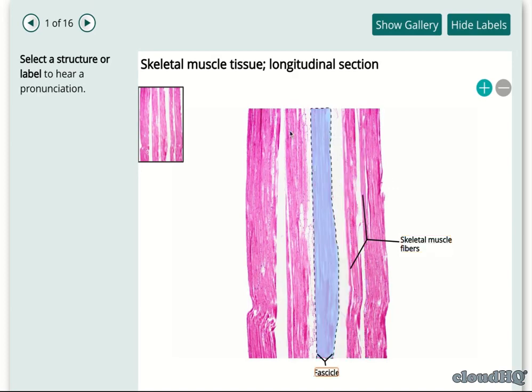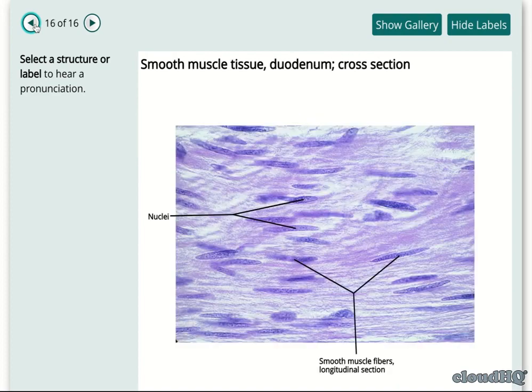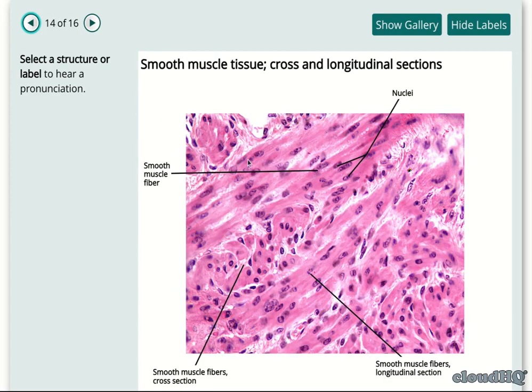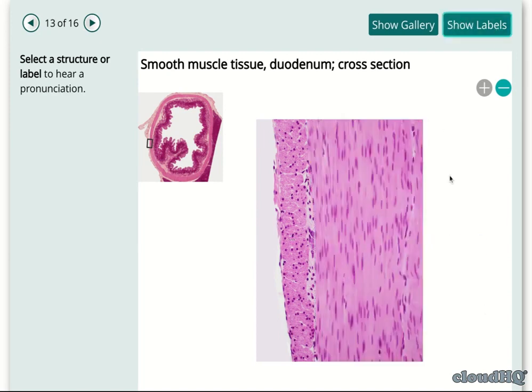Yeah, so basically smooth muscle is just a really thick band of pink with cells stretched out in between them. There's no branching, there's no striations, there's no intercalated discs. It is just pink with cells. A lot of people do have trouble with smooth muscle. They will consider it to be dense, regular, collagenous connective tissue. The main thing to look for is the really elongated nuclei.